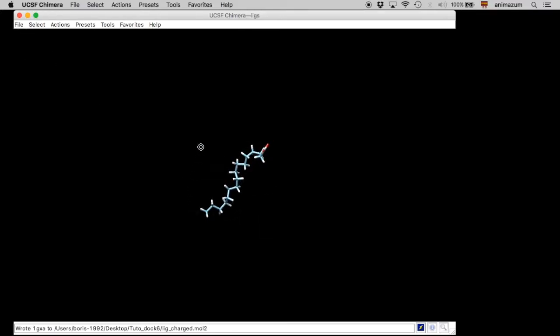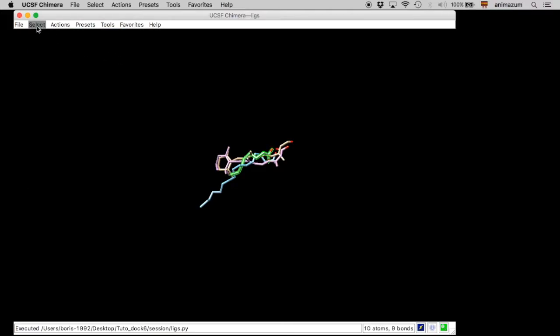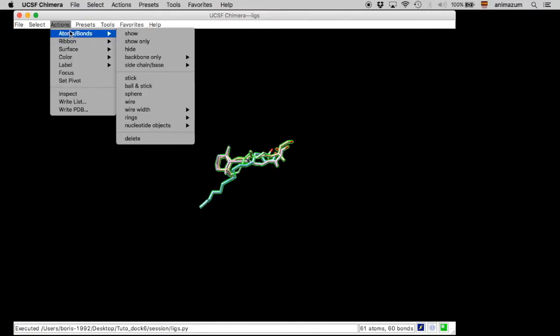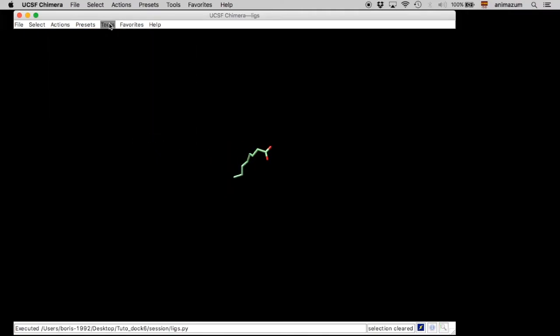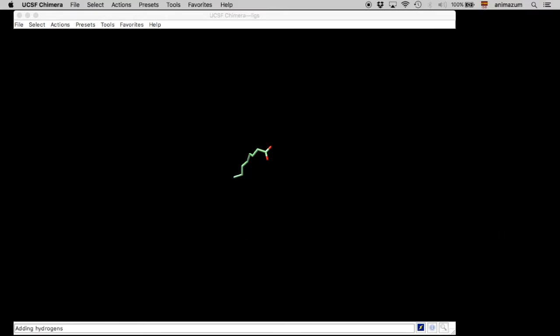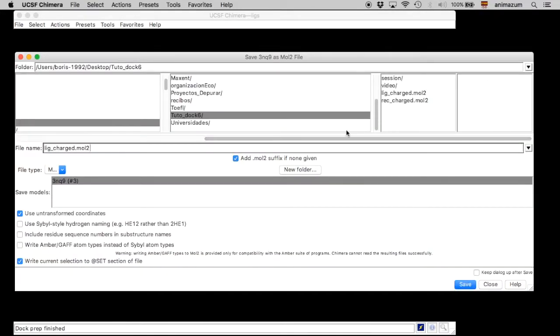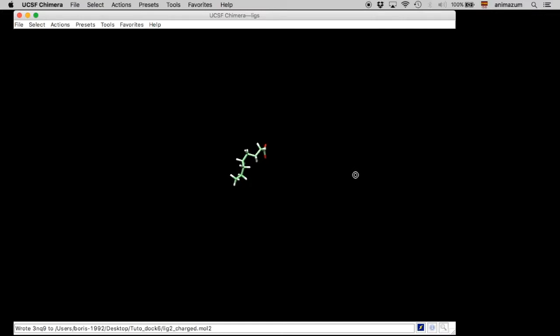Now we are going to reopen the session and in this situation we are going to select the other ligands and prepare them separately using the same approach — Dock Prep with hydrogens and charges. This time I am going to name this ligand as 'Lig2_charged'. Save. For the rest of the ligands, we are going to do the same.